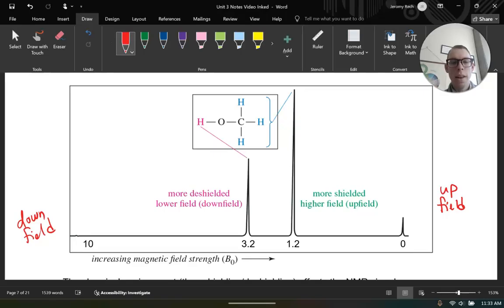And then our y-axis is going to be signal intensity. So we actually won't even show that most of the time. It's just a number of counts, and it's pseudo-relative. Things like the integration, which we'll talk about, are going to be a lot more important than the intensity. So unlike your IR, our baseline is going to be at the bottom, and then we'll have a spike that will appear or come up if you have protons in that environment.